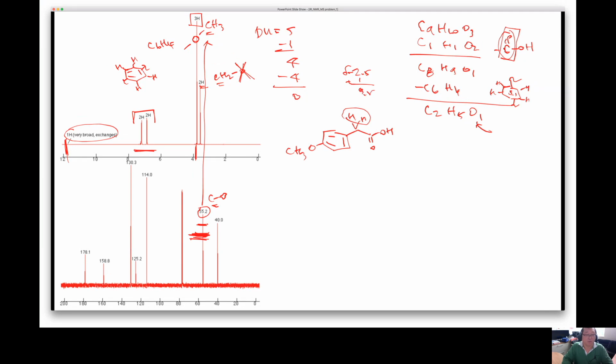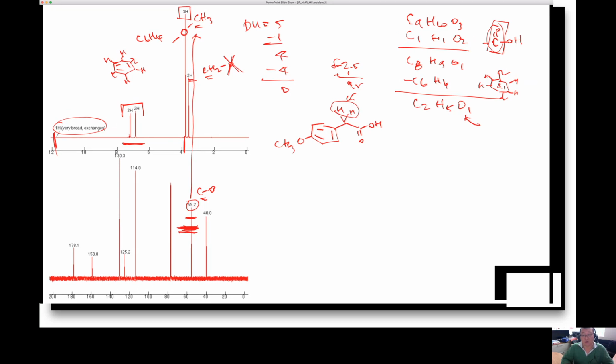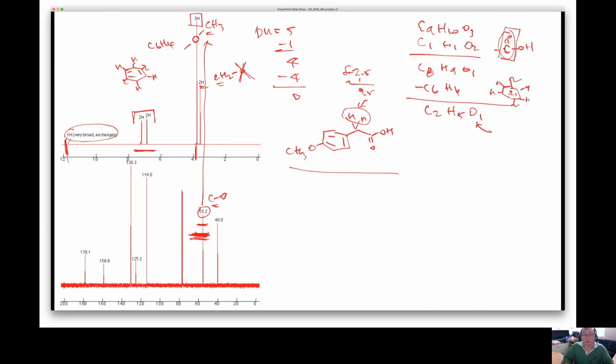I think that's a little bit further down, but that sort of explains why this CH2 is de-shielded, almost like it's next to an oxygen, but it is not next to an oxygen because we don't see the two carbon peaks next to an oxygen there. So I think this is a possibility. If you don't look at that, you may potentially get an answer like this. If you put that one as next to oxygen, then you put CH2 right there, and then double bonds, and then there is a carboxylic acid.